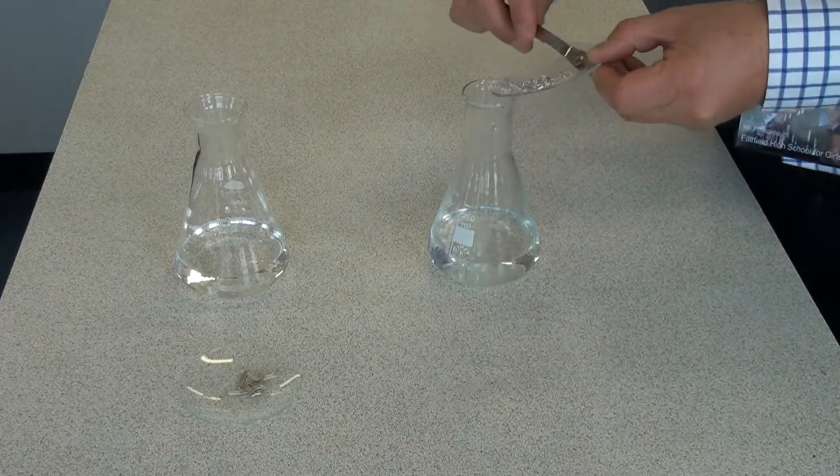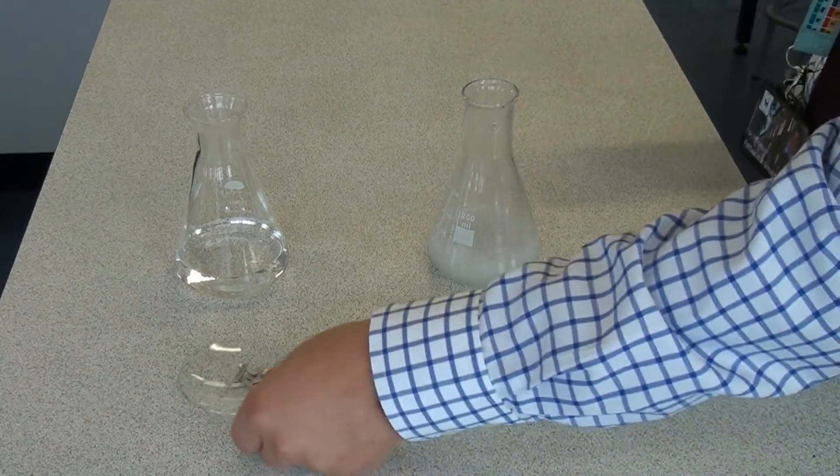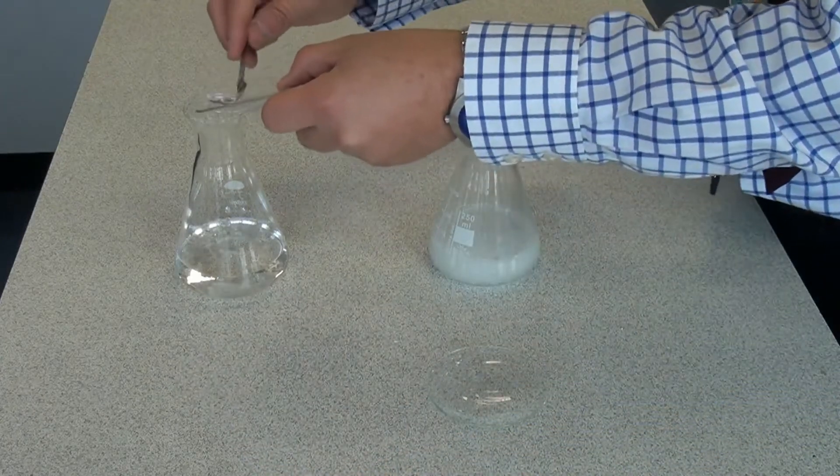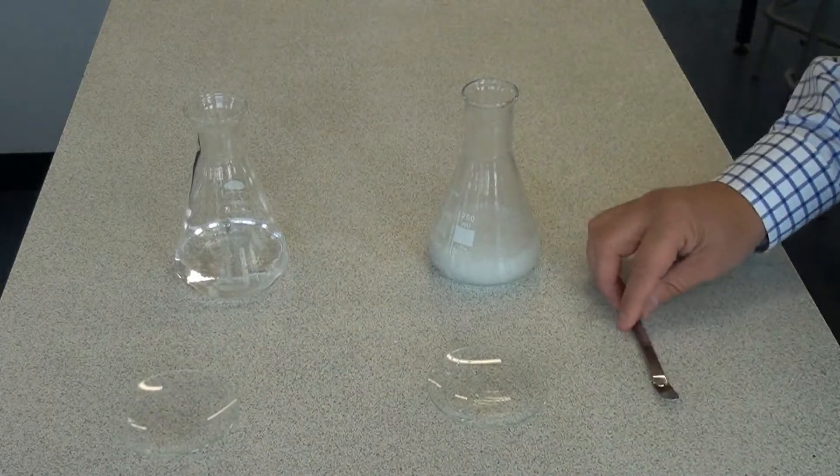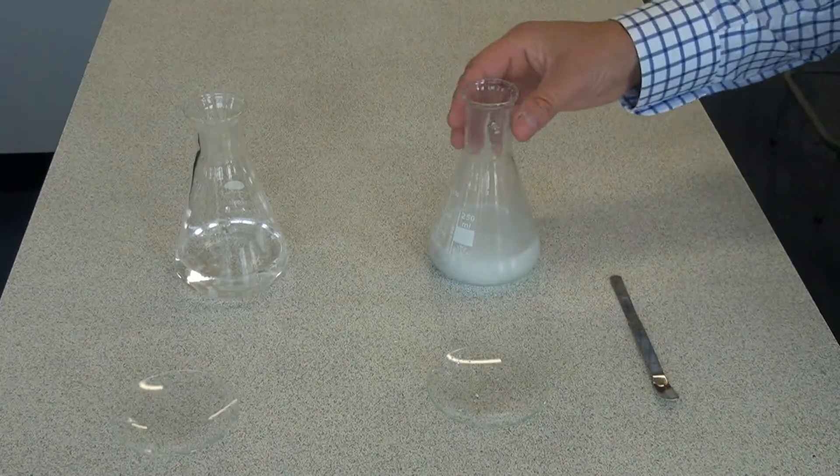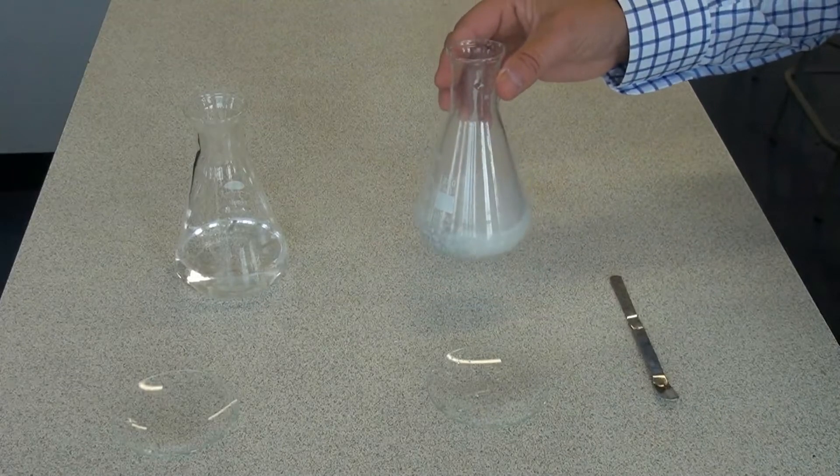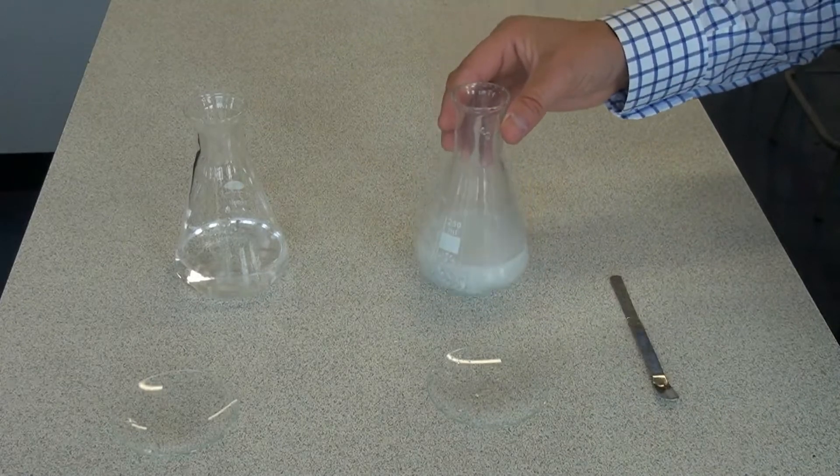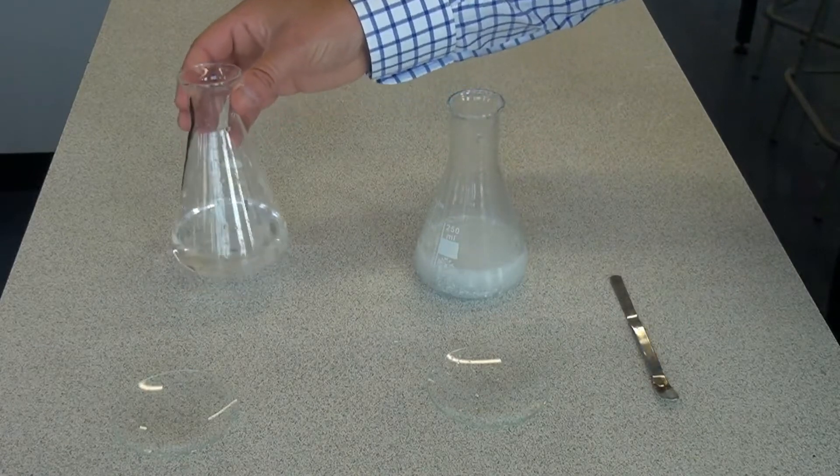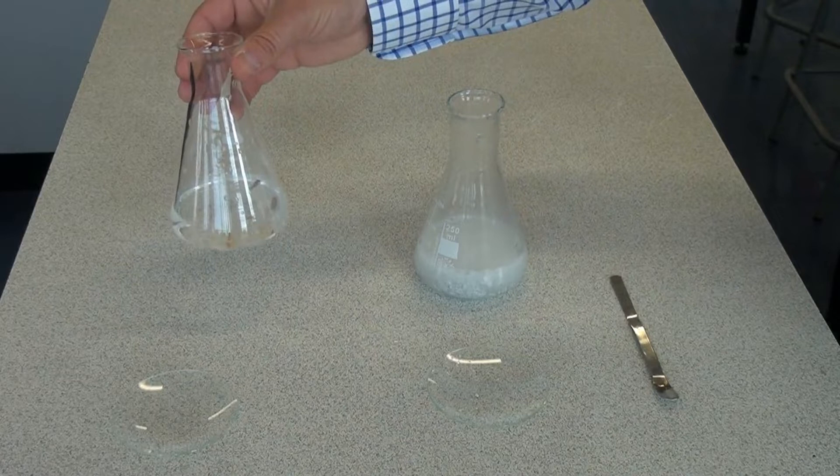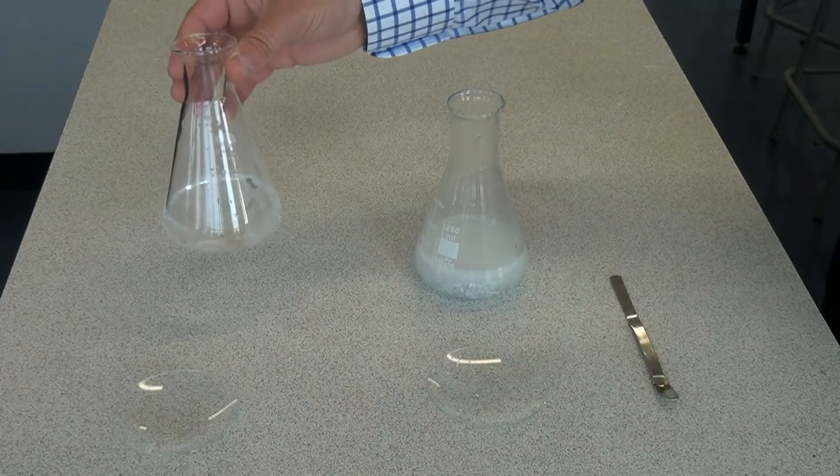So the small pieces going in first of all, straight away we are getting quite a vigorous reaction there and then the larger pieces. So it's quite obvious that the small pieces are reacting much much quicker so we would say these have a higher rate of reaction. Whereas the larger pieces are reacting more slowly, we can tell there's less fizzing and less bubbling, so we would say that has a lower rate of reaction.